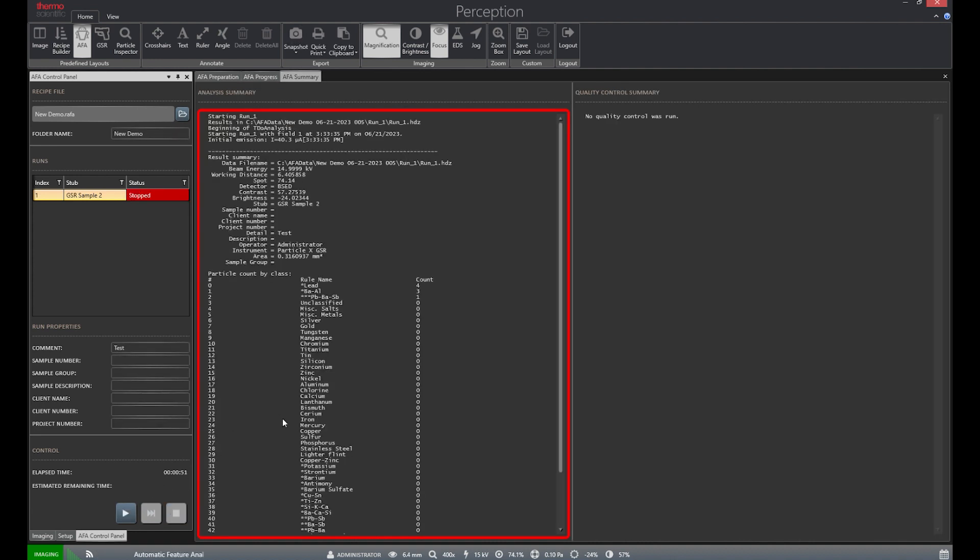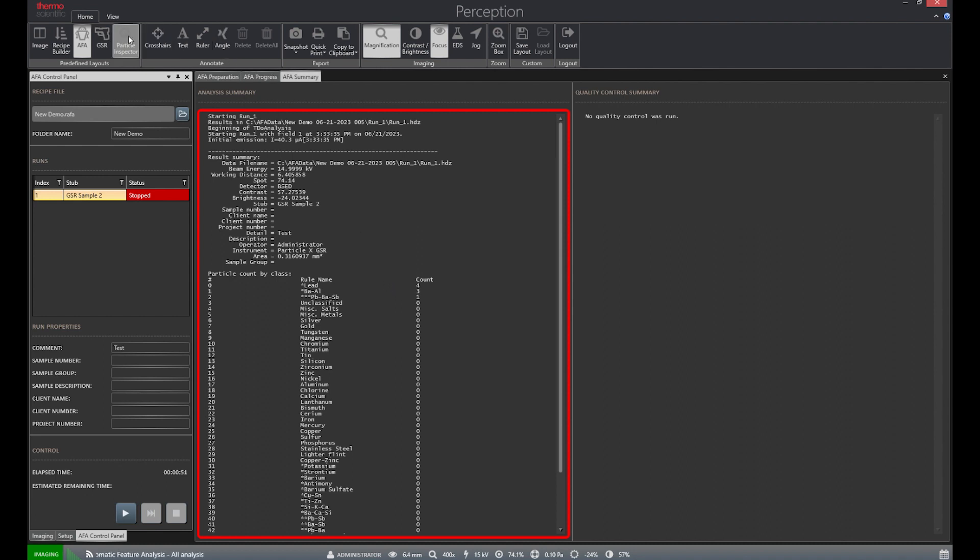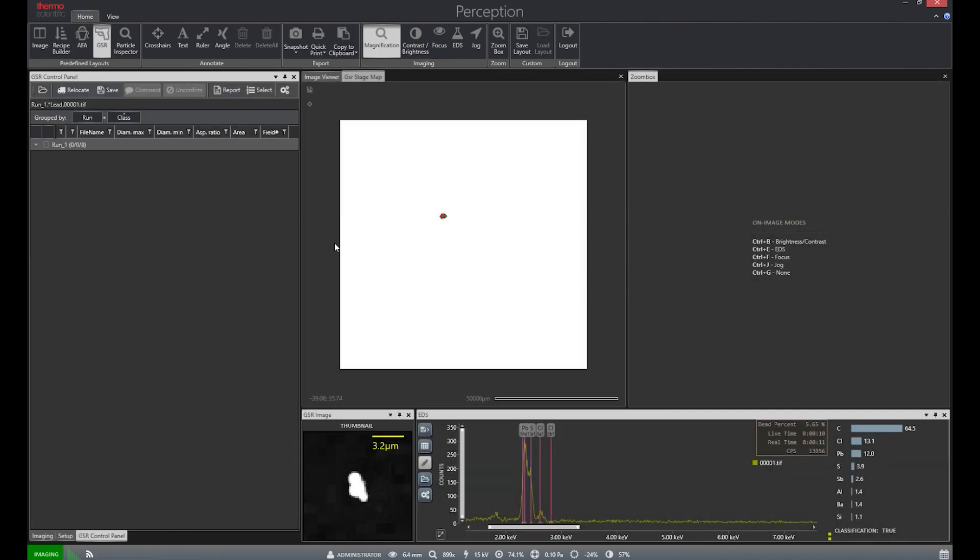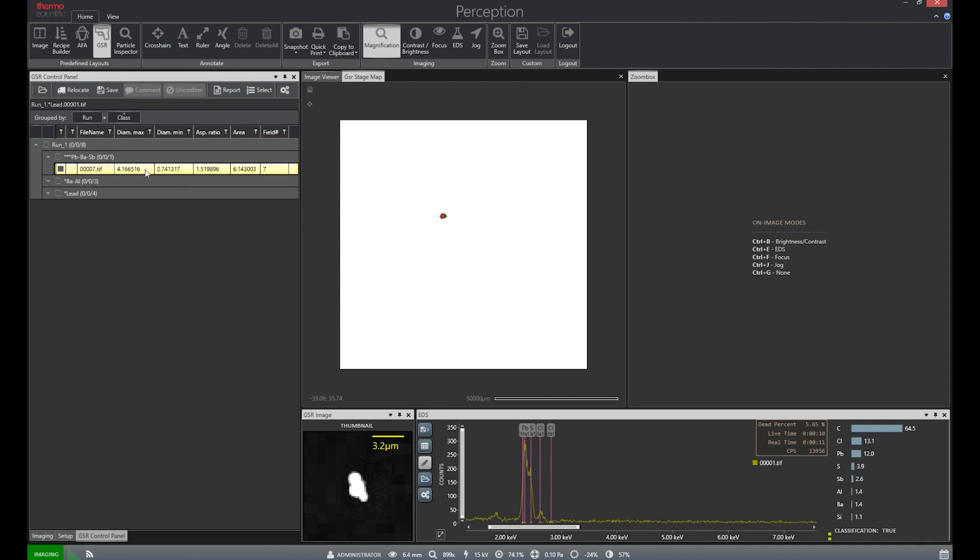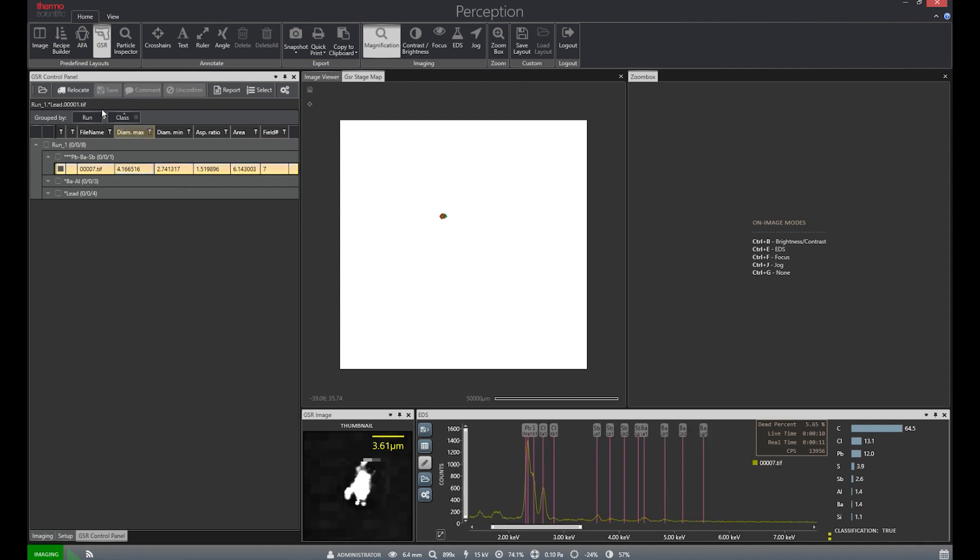This includes the category of particle types, the number of each found, beam settings used, and much more. Now we can move over to the GSR reporter tab to look through each particle. We can open up our previous dataset and begin to look at particle groups, specifically the lead, barium, and antimony group.